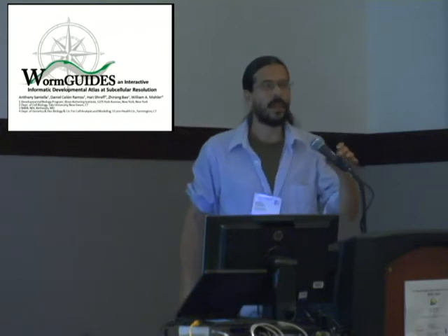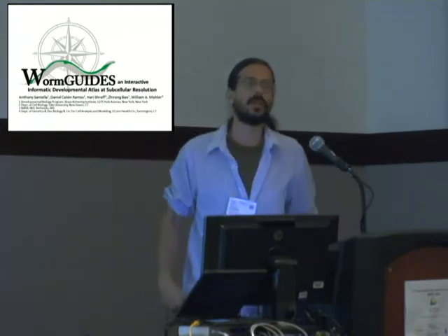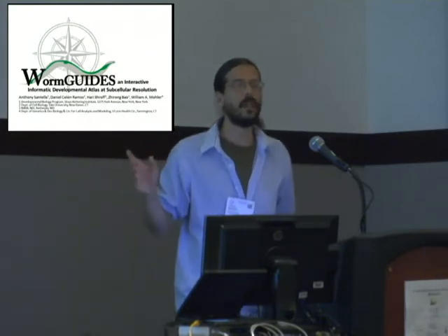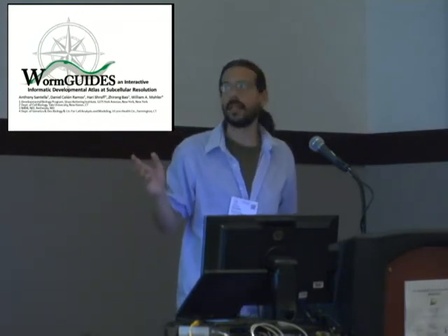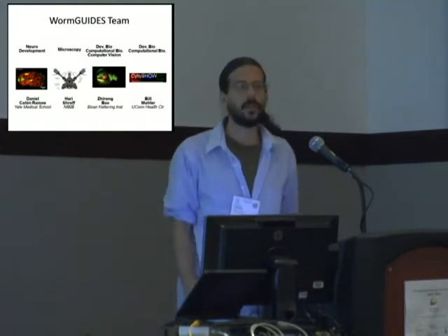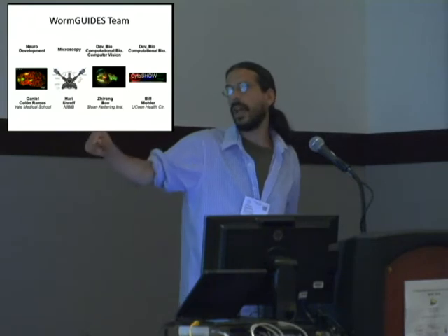Hi, it's good to have an opportunity to talk about WormGUIDES, which is an ongoing project to try and build an interactive, single-cell level atlas of C. elegans development. So this is a multi-institution project that's split between a number of labs.